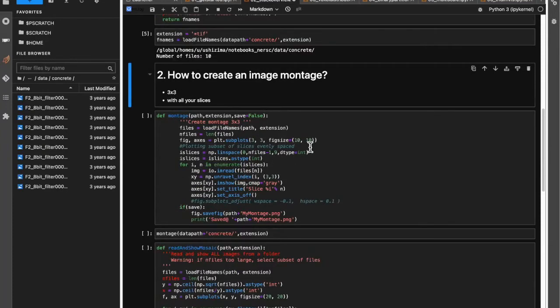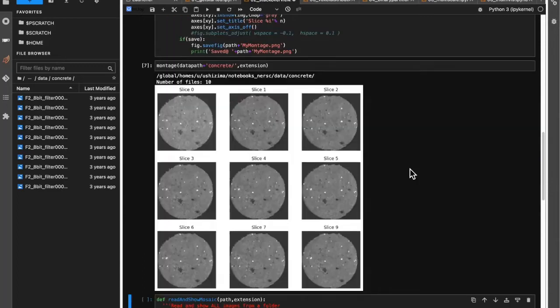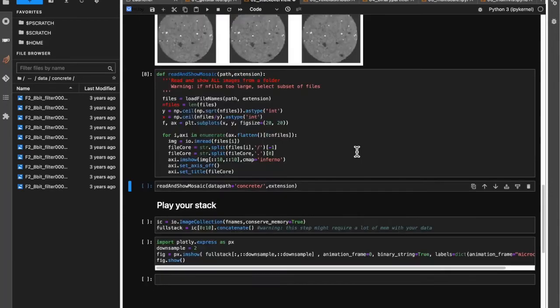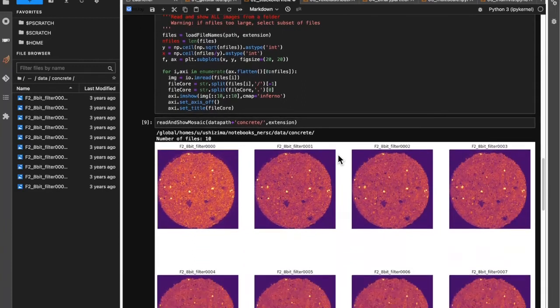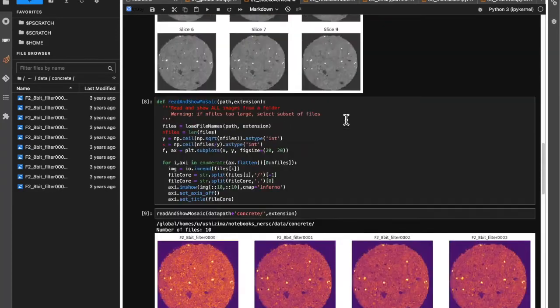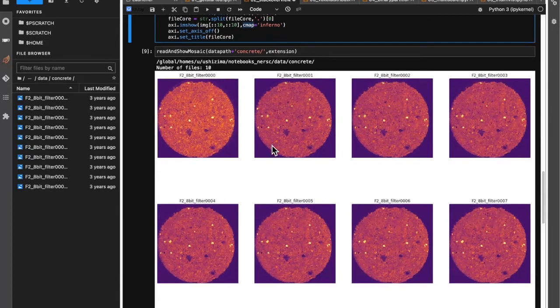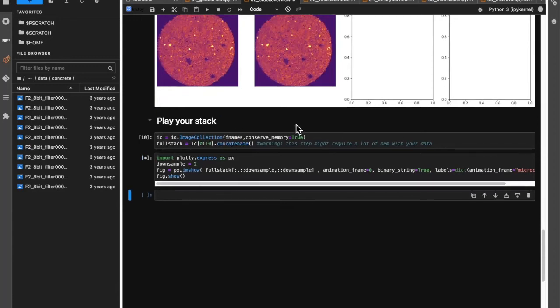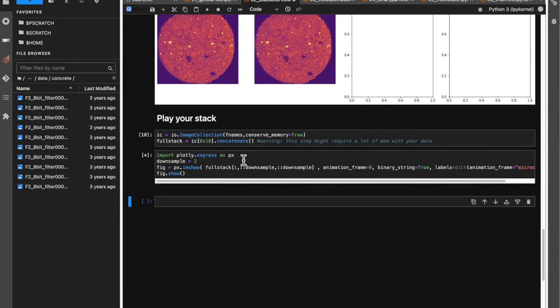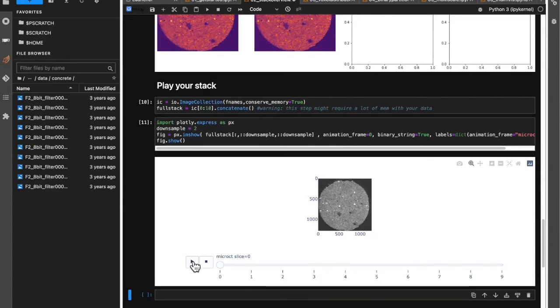Again, that same dataset. Now I want not to see one slice at a time, but be able to create a montage — in this case, a montage of three by three of my slices. Because you selected the best ones and put them in a separate folder, you want to see all the slices, and that's the function you would use. Notice that there are different color maps here. Inferno is helpful to basically emphasize a few of the structures in this concrete. You can also concatenate this information to have a full stack, and I'll use the Plotly library to create a panel that allows me to play my slices as a video.